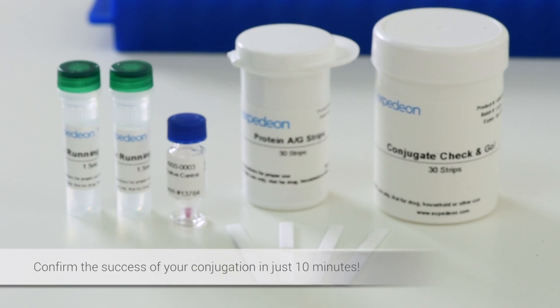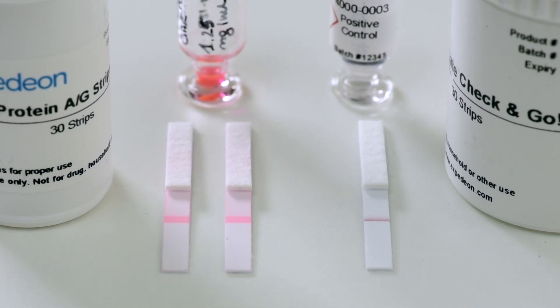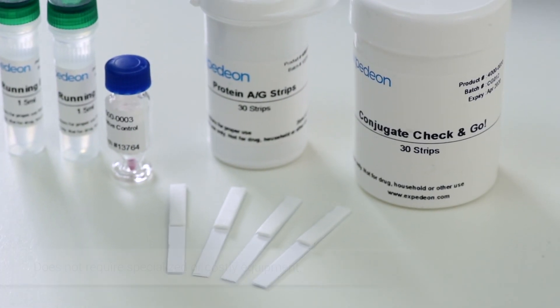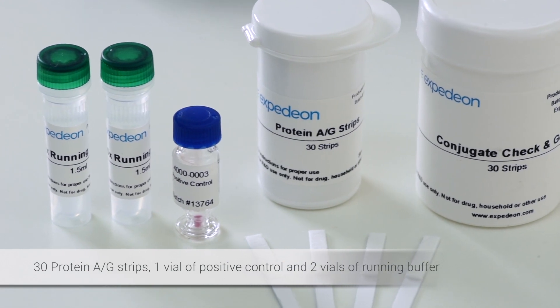Confirm the success of your conjugation in just 10 minutes using the Expedience Conjugate Check and Go Kit. Our Conjugate Check and Go Kit is a simple immunochromatography test that does not require any specialized or costly equipment. The kit contains 30 protein A/G strips, one vial of positive control, and two vials of running buffer.